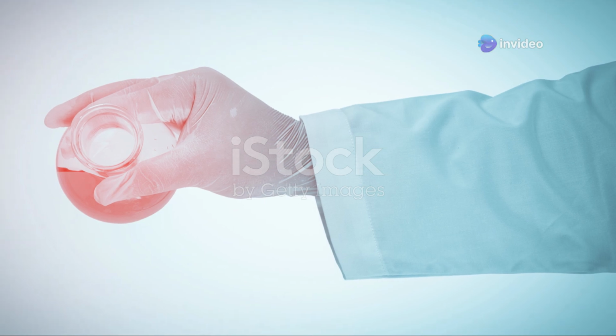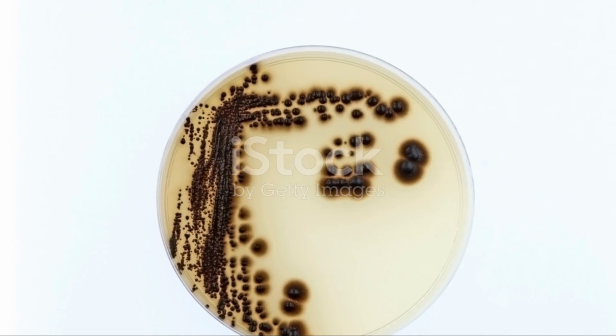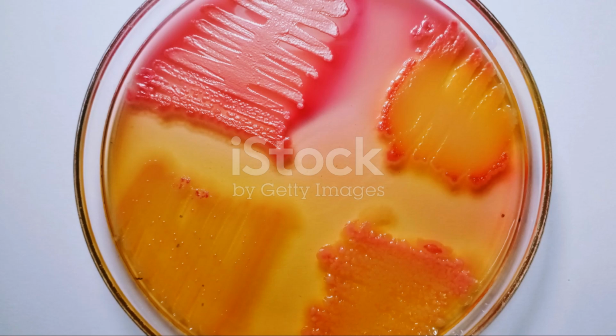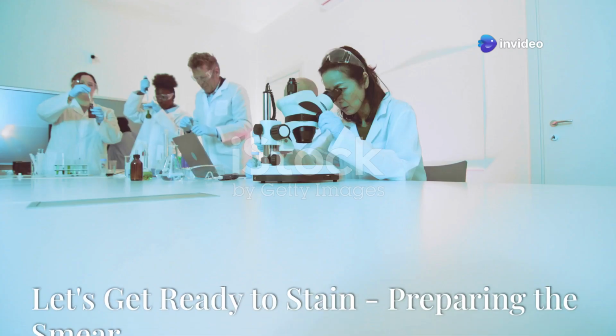Finally, we have safranin, our counterstain. This pink dye steps in to stain the decolorized gram-negative bacteria, giving them a lovely pink or red outfit. It's like giving the other team their jerseys so we can tell them apart.